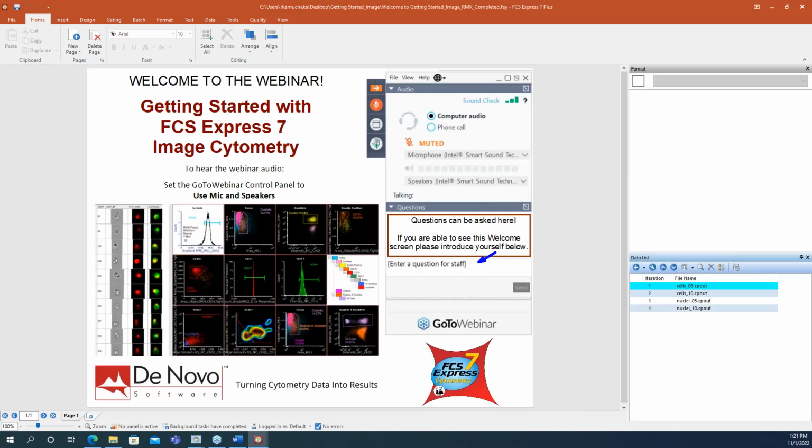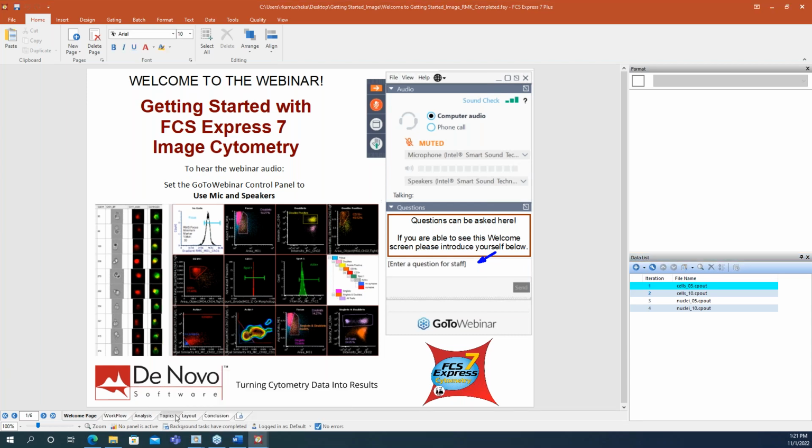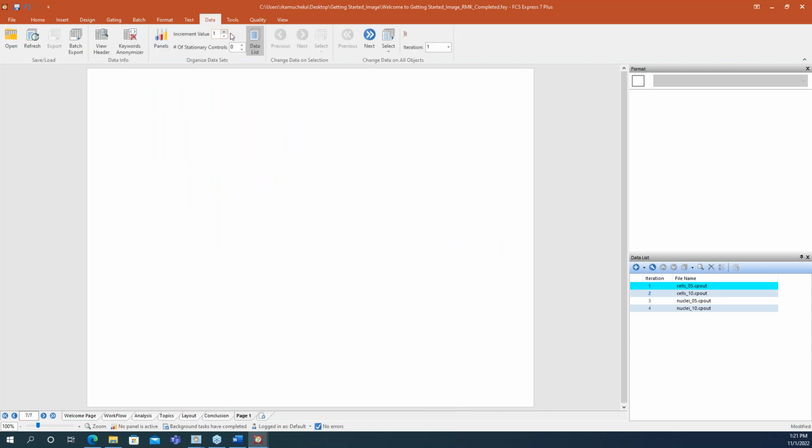Take a moment here to get my FCS Express back up. All right, here we go.